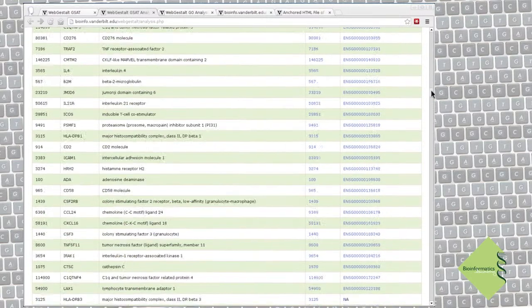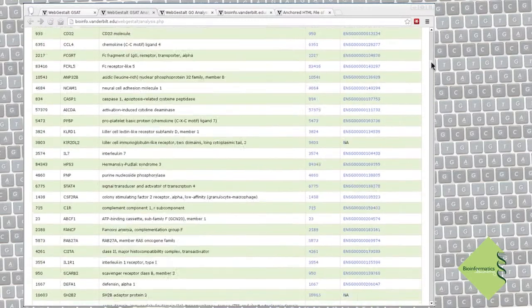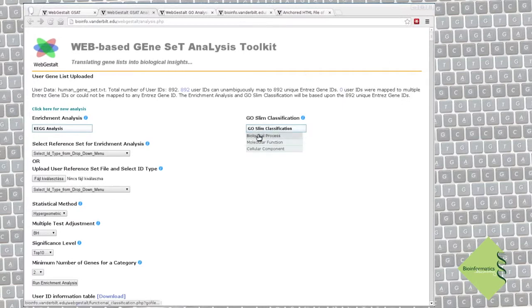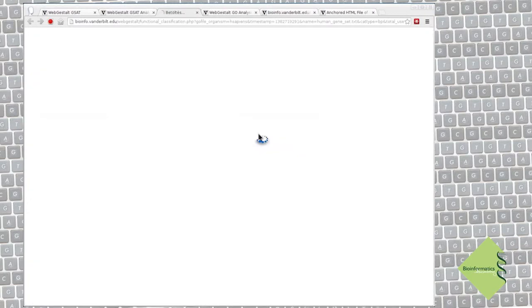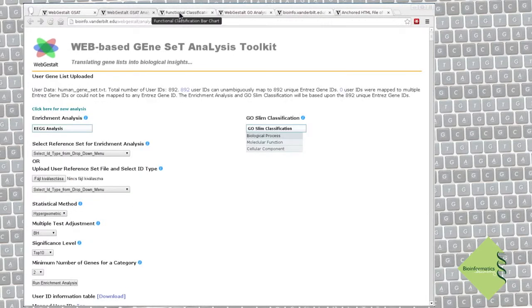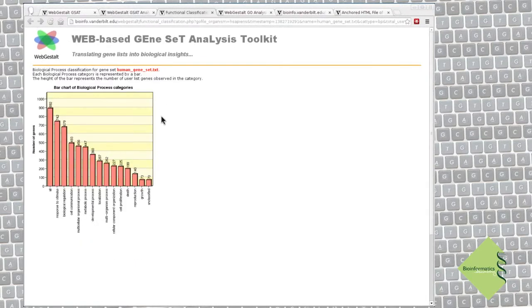Let's continue with a brief overview of our dataset. We can do a simple GeoSlim classification by clicking here. See that the results are opening on a new page, so it is easy to go back and do something else with the same original dataset.